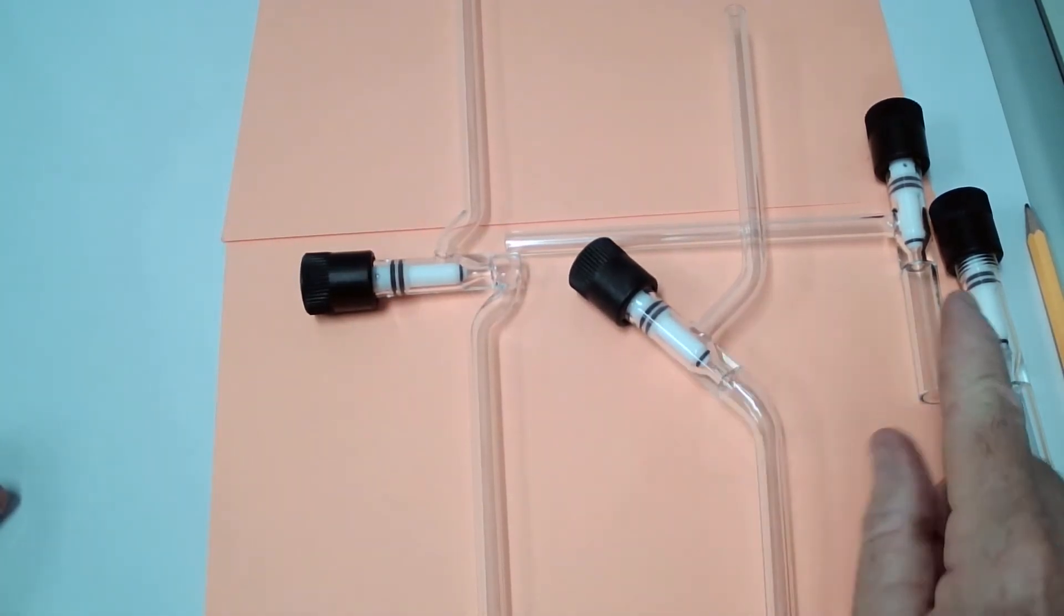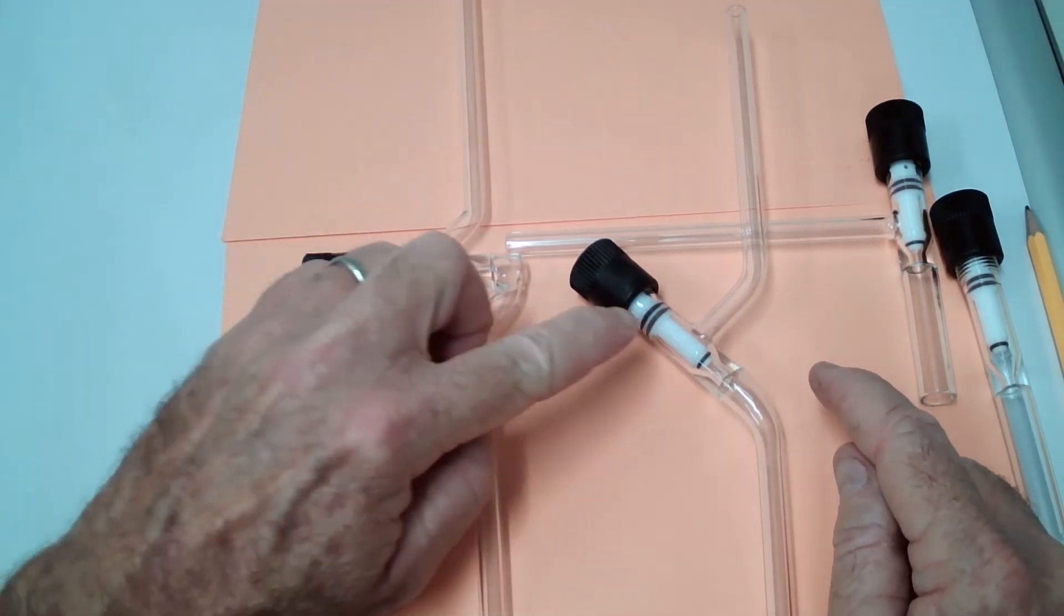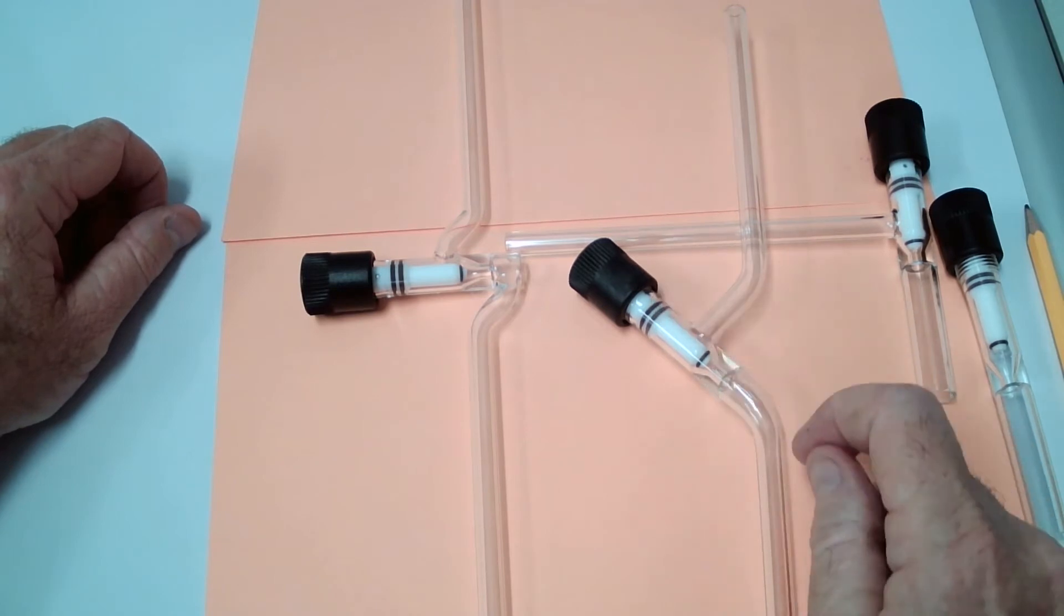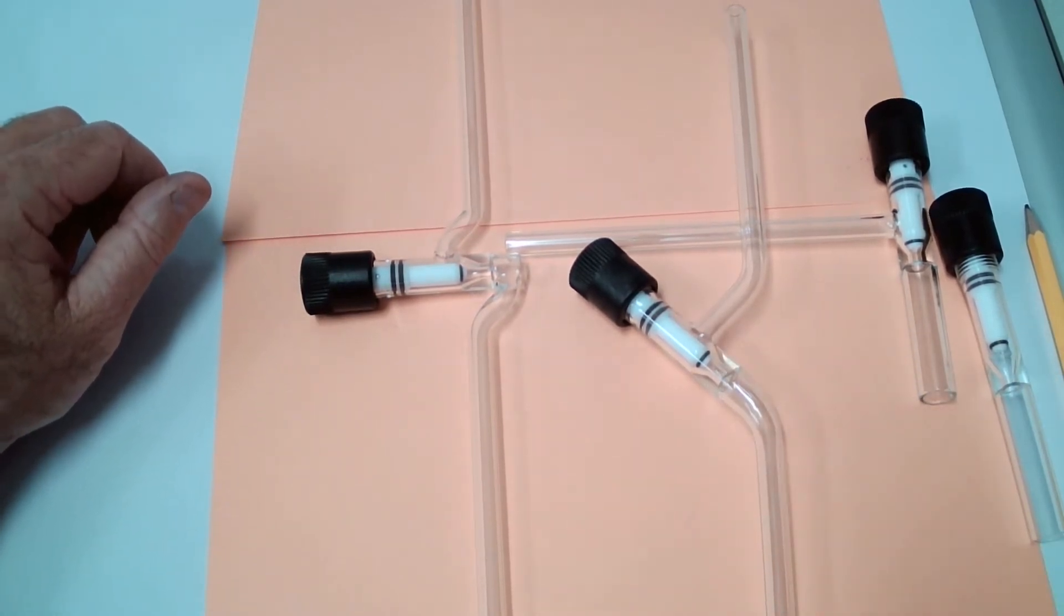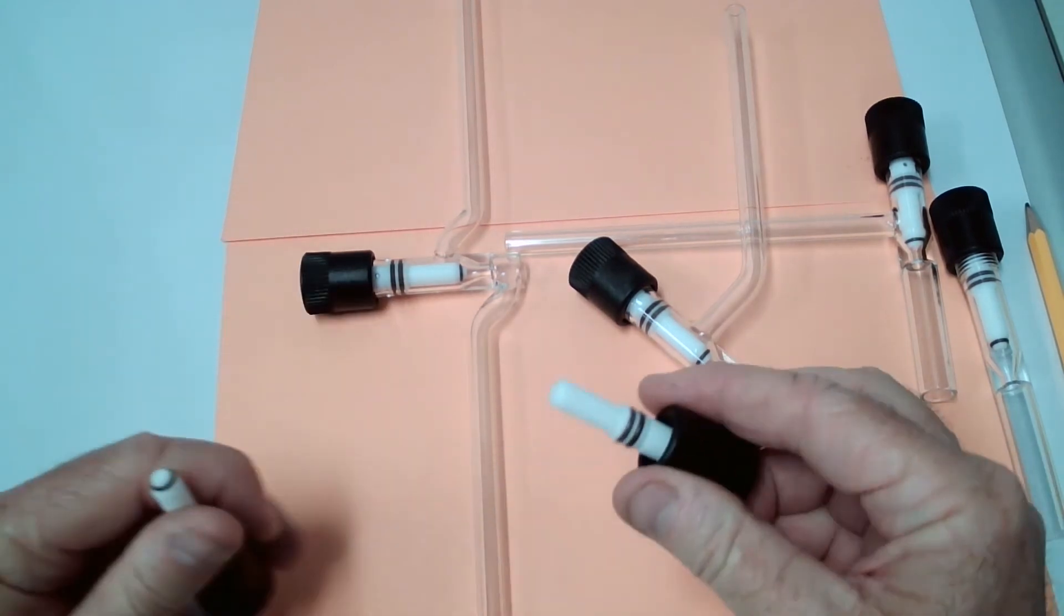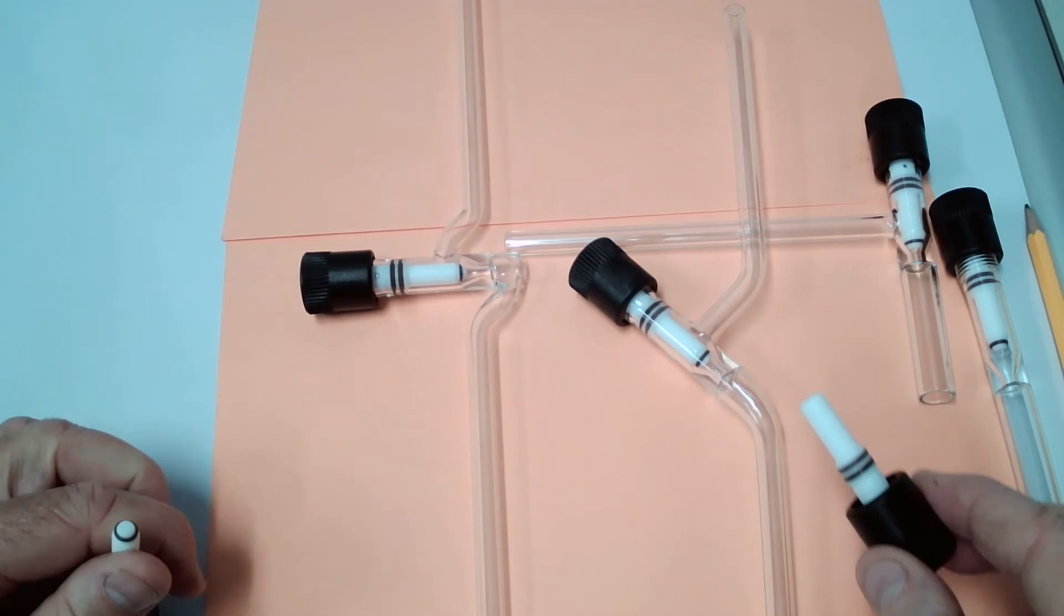They are all the same as far as the valve thread with the Teflon backing O-rings and the tip O-rings. All the plugs are interchangeable, so all these will also use the valve plug without the tip O-ring, just plain Teflon.